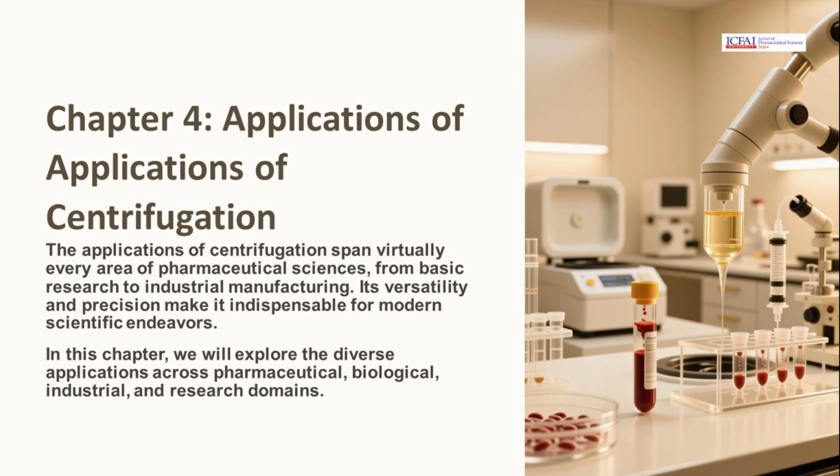The applications of centrifugation span virtually every area of pharmaceutical sciences, from basic research to industrial manufacturing. Its versatility and precision make it indispensable for modern scientific endeavors. In this chapter, we will explore the diverse applications across pharmaceutical, biological, industrial, and research domains.